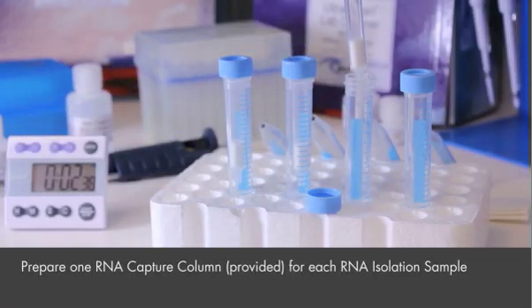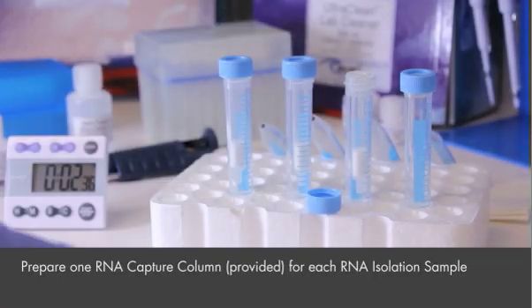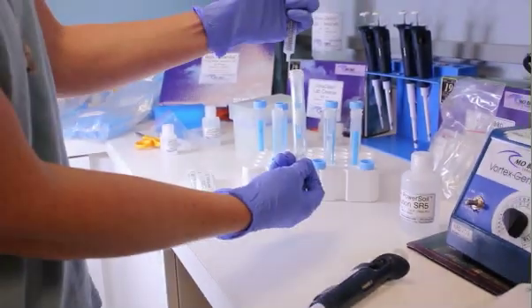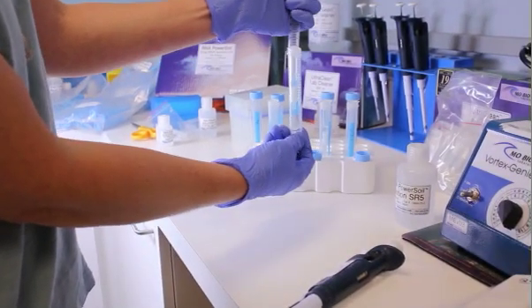Prepare one RNA capture column for each RNA isolation sample. Add 2 mls of solution SR5 to the column. You can let it flow by gravity or aid the flow by using a syringe to increase the pressure.